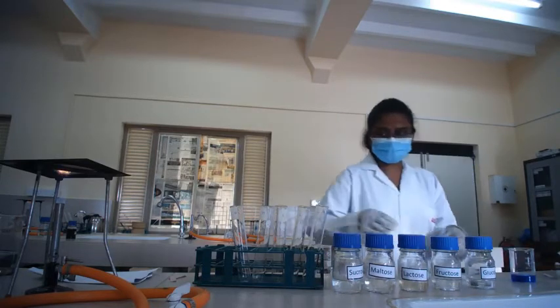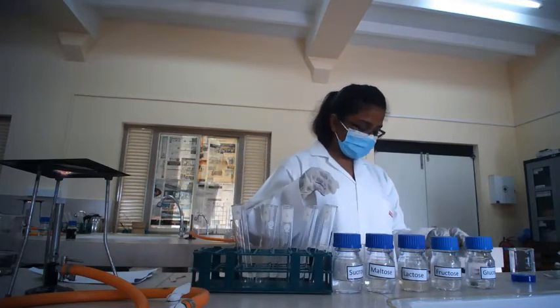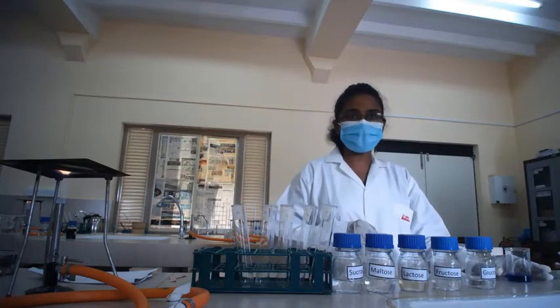Then we need sugar solution. We need 2 milliliters of each sugar solution, and we are going to add 2 milliliters of the Fehling solution.